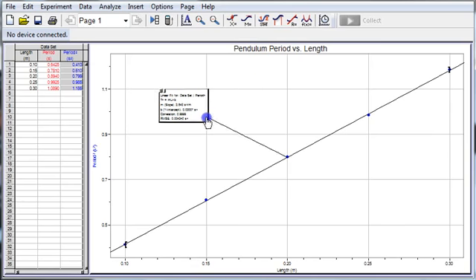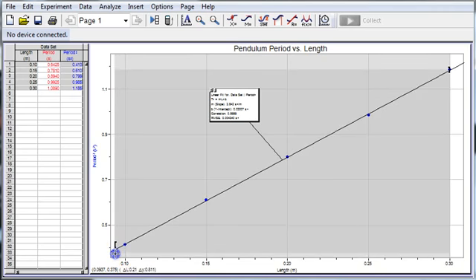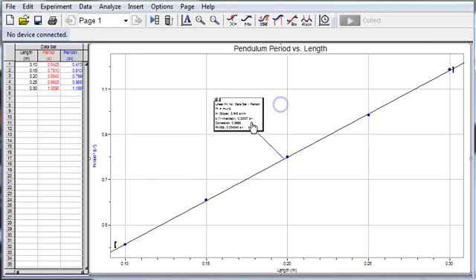And we'll get a linear fit here for our data. This is the best fit line. You can see this bracket over here. You can click and drag this. Put the cursor over it when it changes, and you can select what data you want, but it automatically assumes all the data there. So I can't read that, it's too small. It looks like the slope is 3.8 something maybe. So this will be our best fit line. So we can do that anytime.